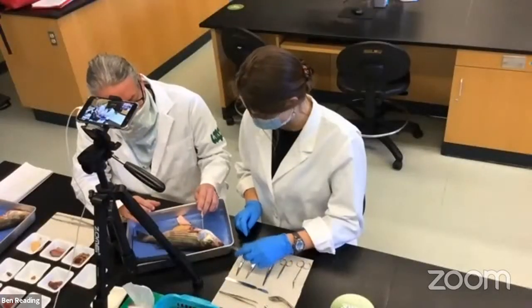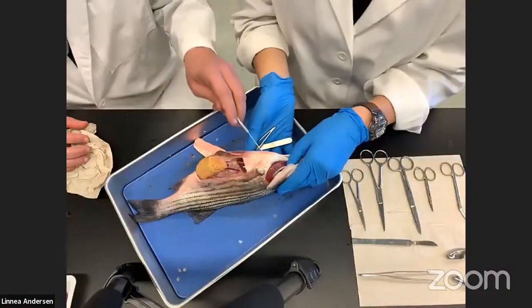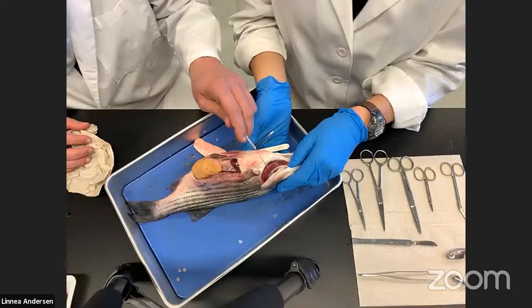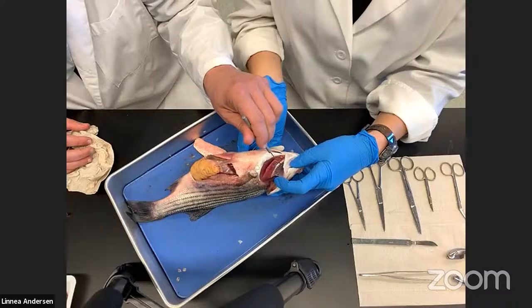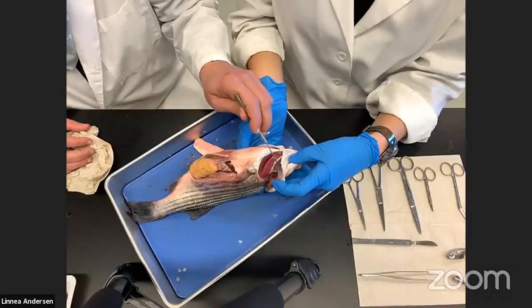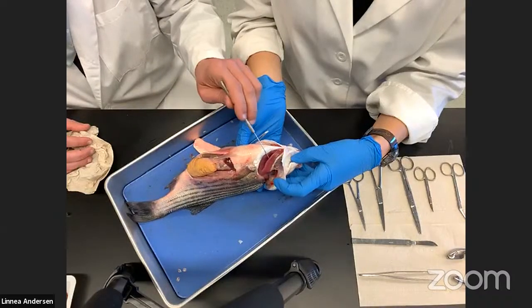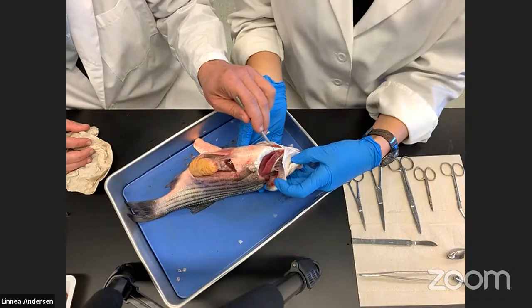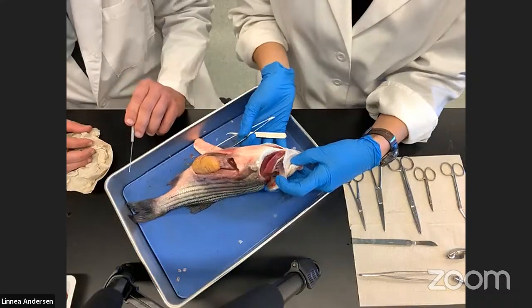If we open up the operculum, we can see the gills underneath being protected. The gill is this pink tissue right here, supported by a bony gill arch. These tooth-like structures are called gill rakers and are involved in feeding. The gill tissue is involved in gas exchange — taking oxygen from the environment and releasing carbon dioxide. That's the inside of the opercular cavity and the gill structures of the fish.